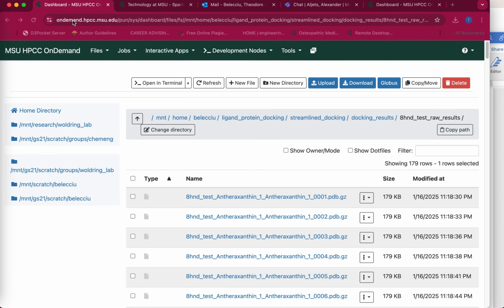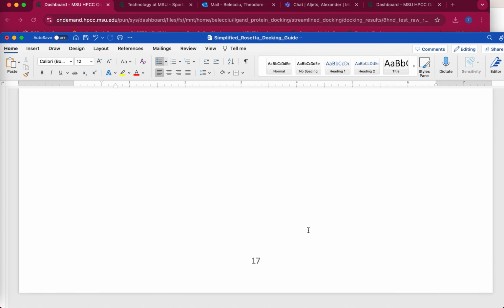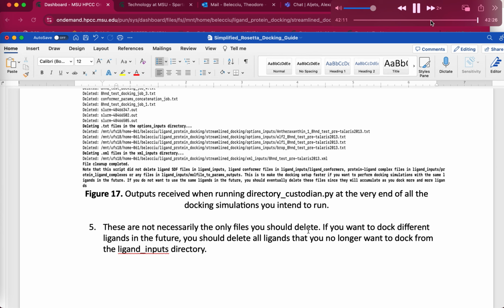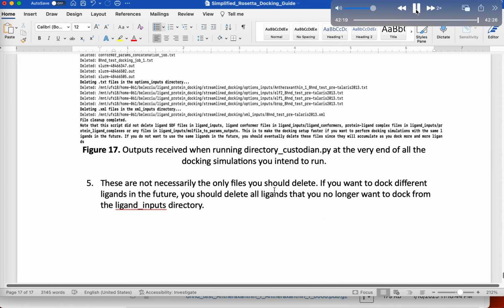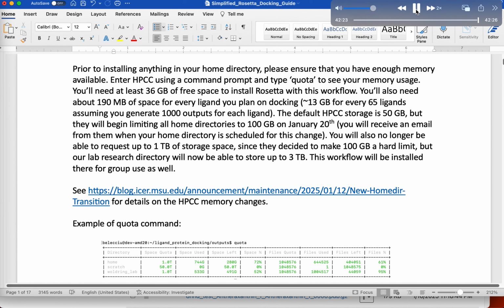But yeah, that's a complex. So that's what you get. Those will finish running, and that's how you run the scripts. This guide contains basically everything I said and more, so feel free to refer to it if this video wasn't helpful enough on its own.